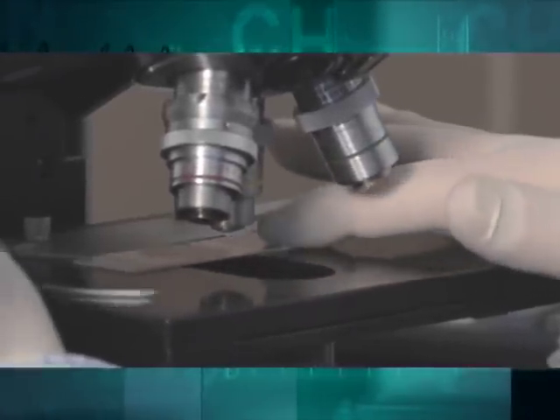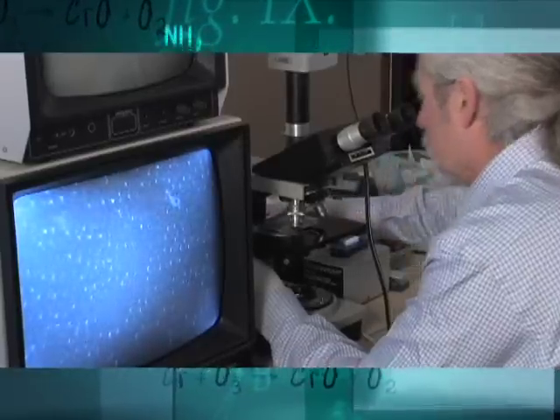We'll place it on the slide. So we can see that his cells have completely disassociated after drinking the water, which once again has restored the net negative polarity to the cell of each and every red blood cell.